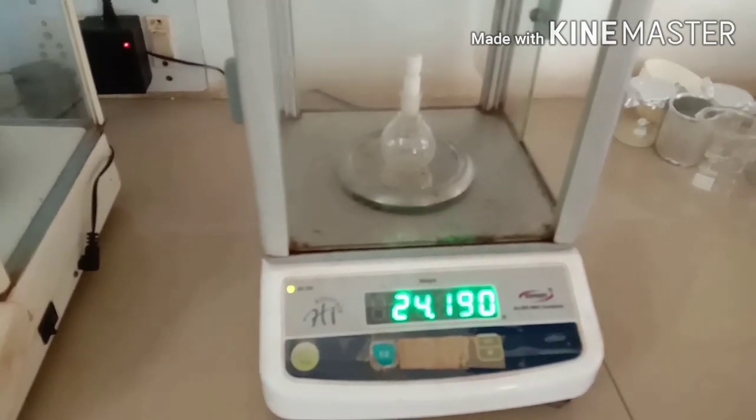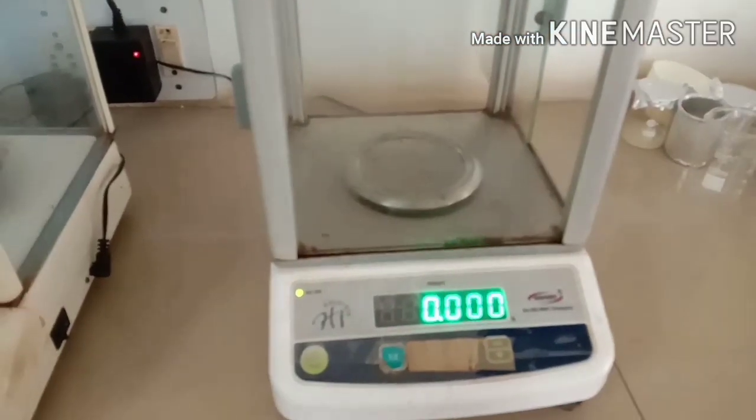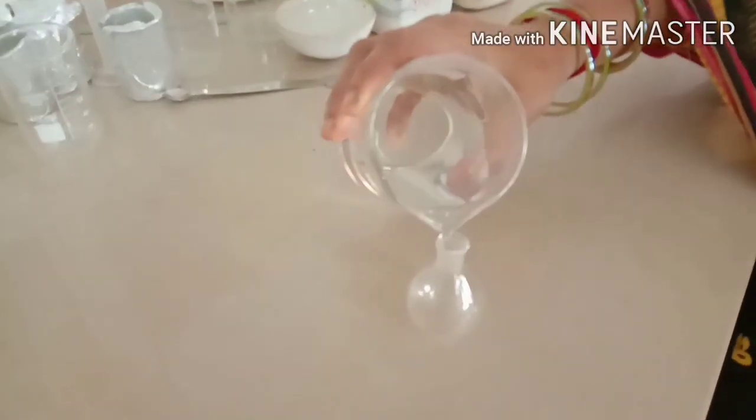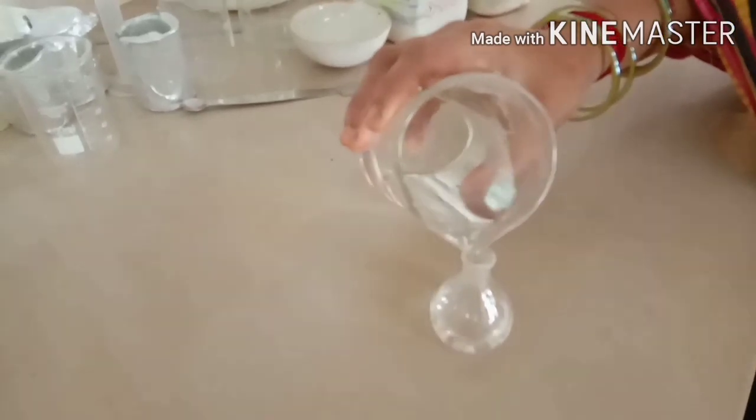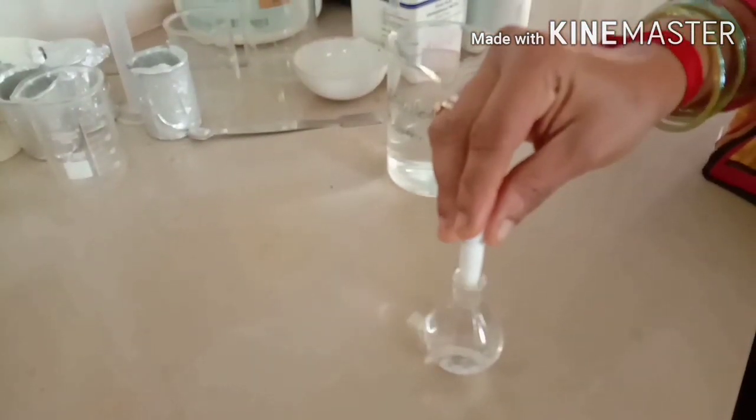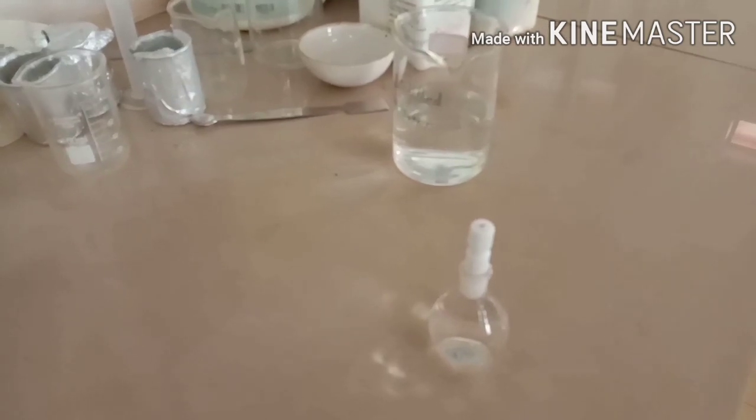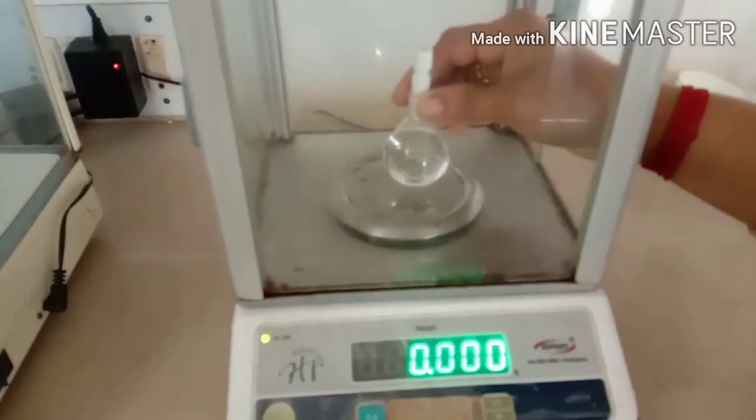The empty specific gravity bottle should be clean. Note down the weight as W1. Next, fill with distilled water. Then once again put the cork. Once again weigh, that is W2, that is weight of the specific gravity bottle plus water.